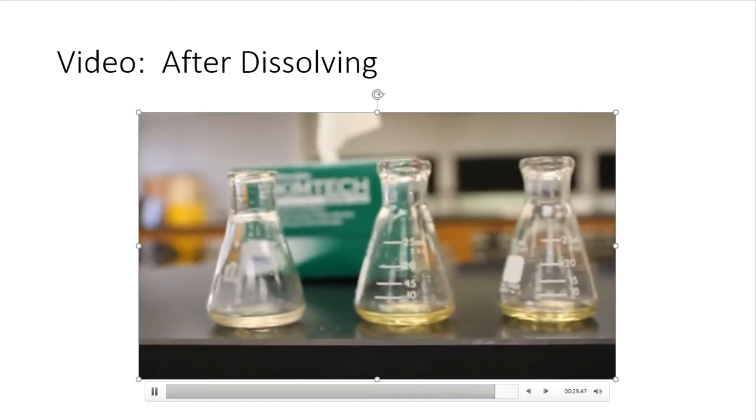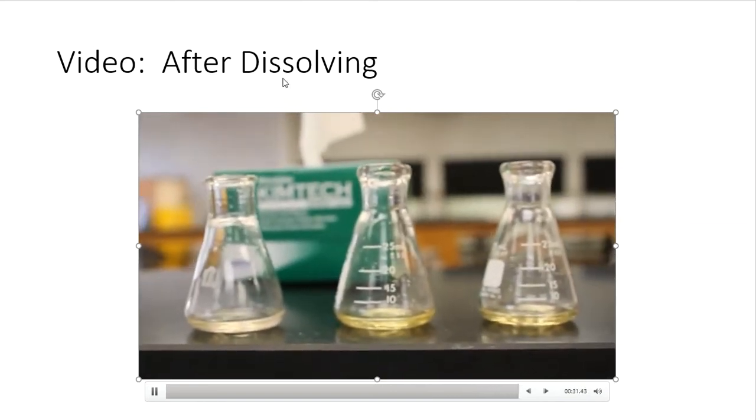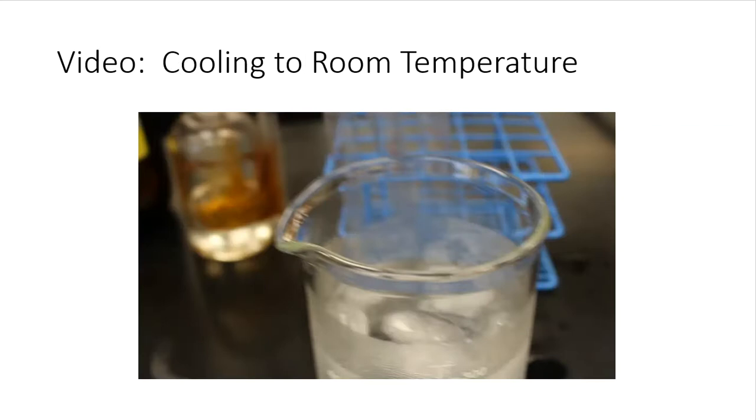Once again, make your observations as you need. All right, so the one to the left is component 1. That is the acetanilide. The component in the middle is number 2. That is the methyl hydroxy, blah, blah, blah. And then number 3 is going to be just the methyl benzoate. Simple and clean, right? All right, so the next one is another video because at this point it's going to tell me to cool it.